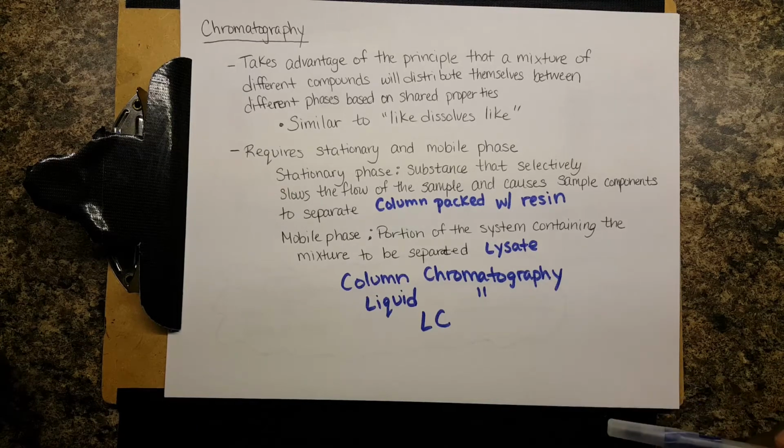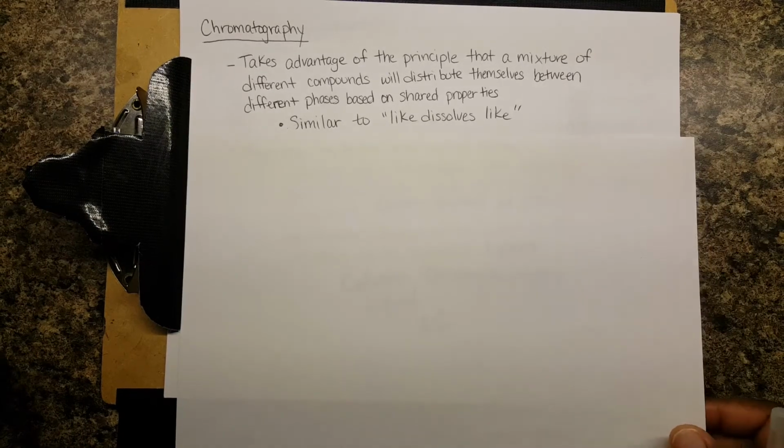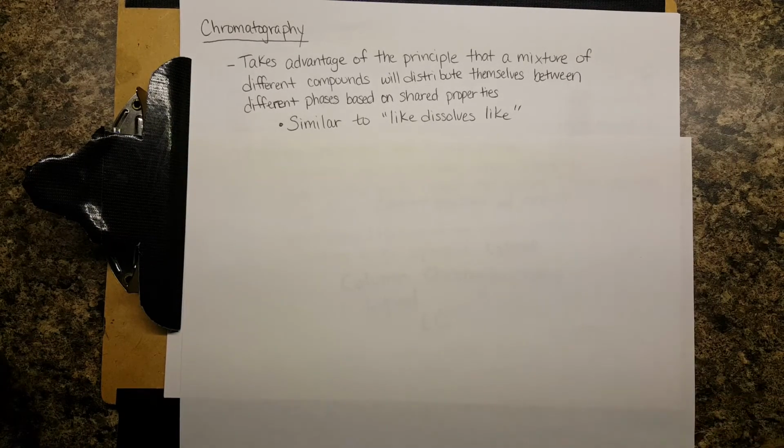So this brings us to chromatography. We have to have some way of separating our POI from everything else. I'm going to cover up half of this slide. It's a little bit intimidating.